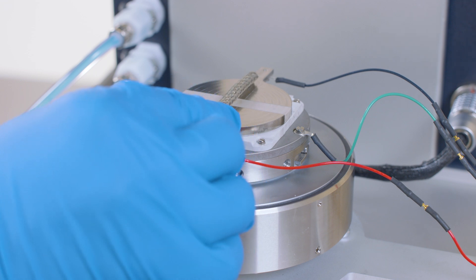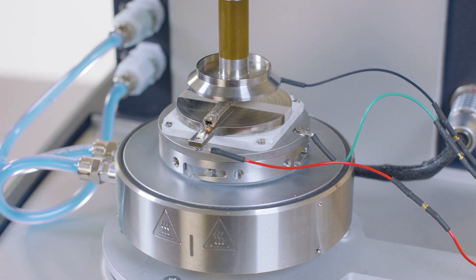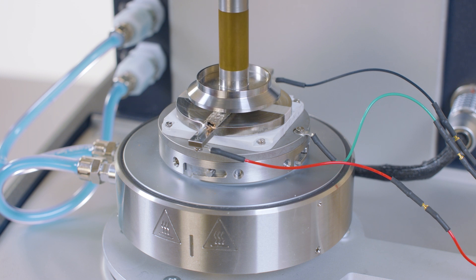When prompted, install the shorting strip. The instrument automatically lowers the head and applies 50 Newtons of force on the shorting strip to establish contact before performing the shorting calibration.